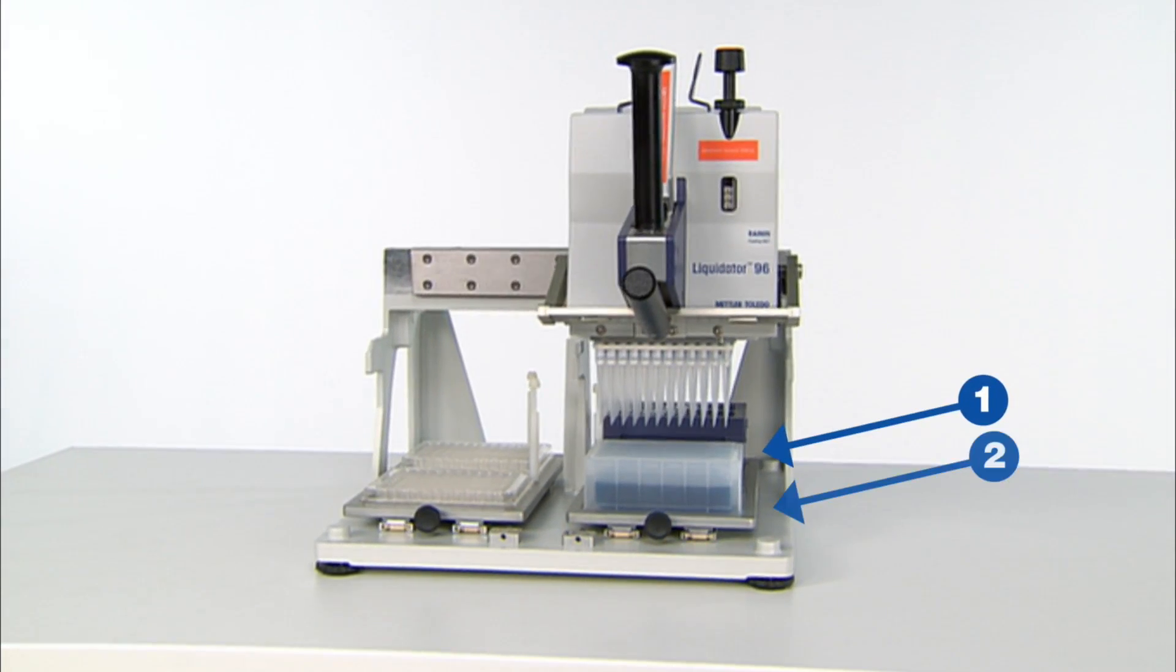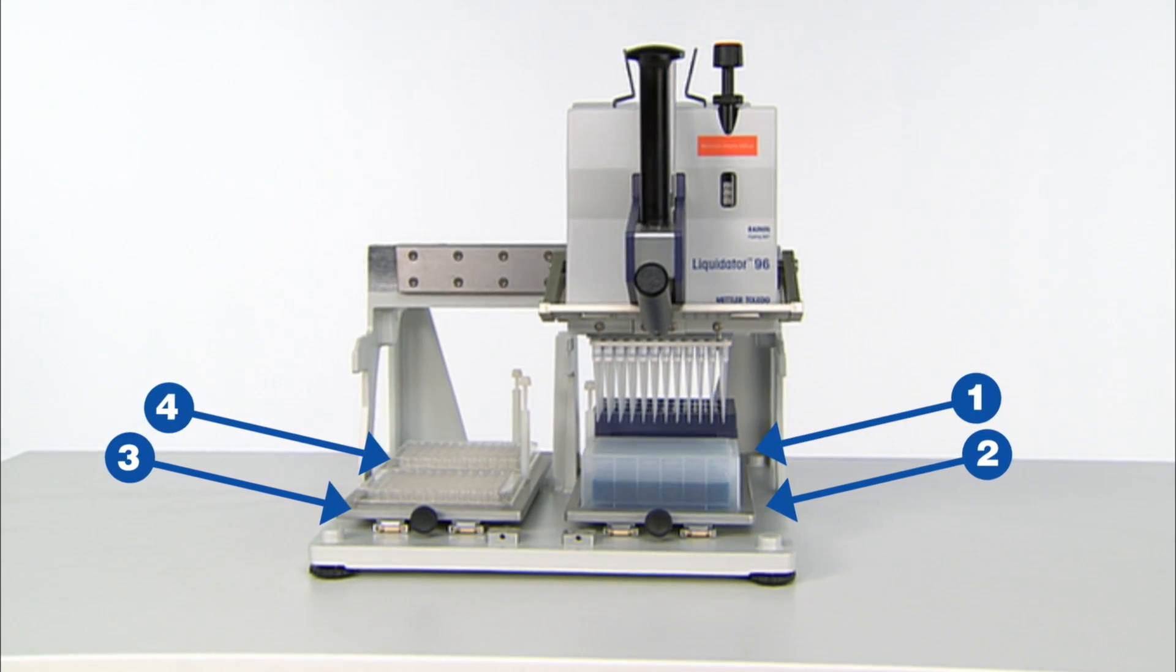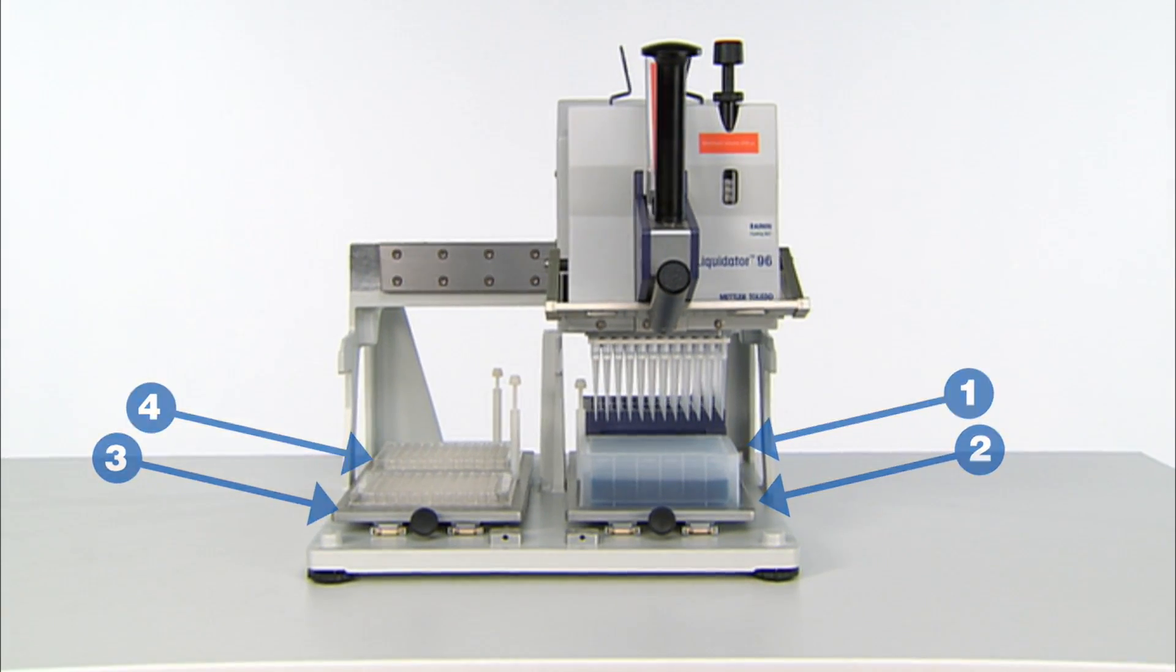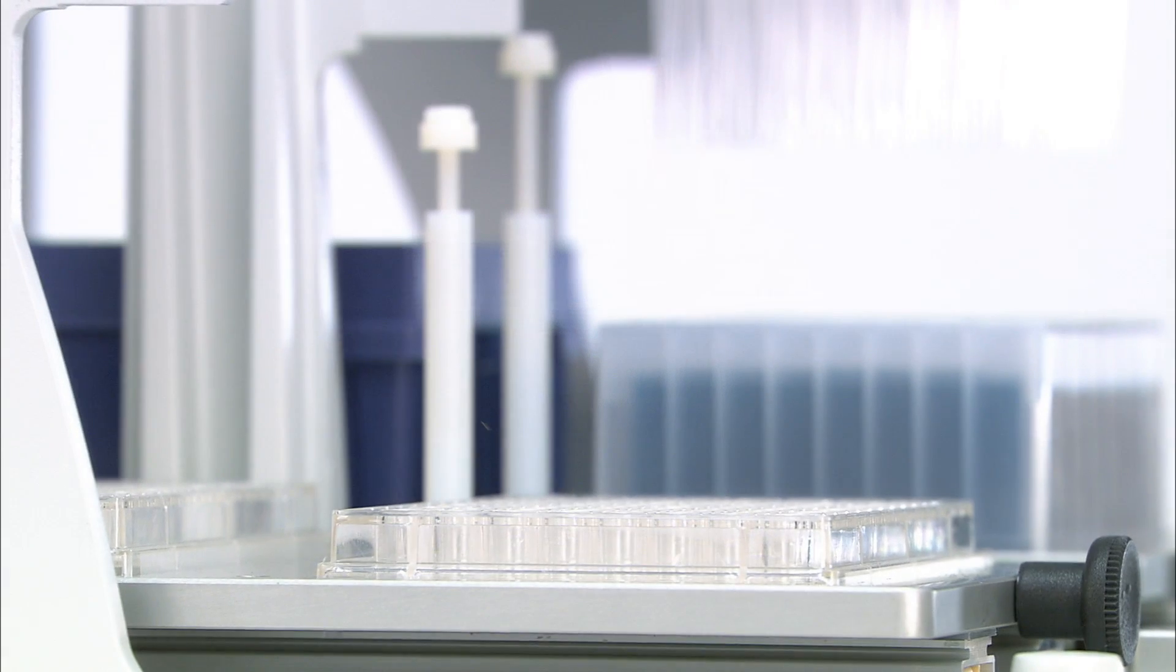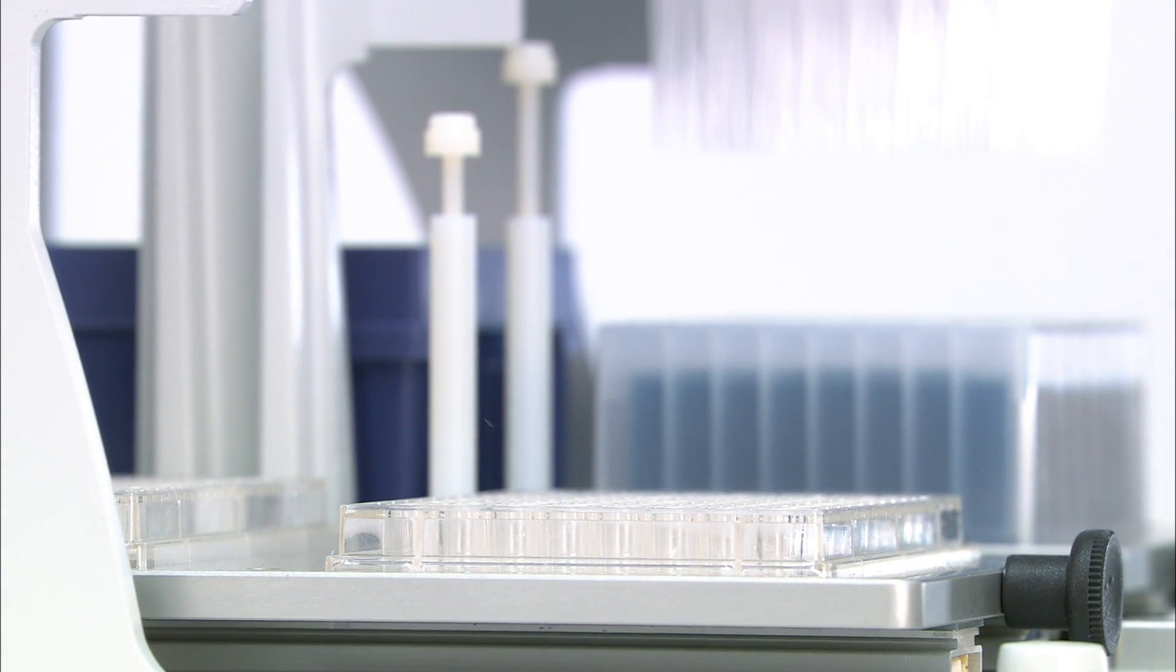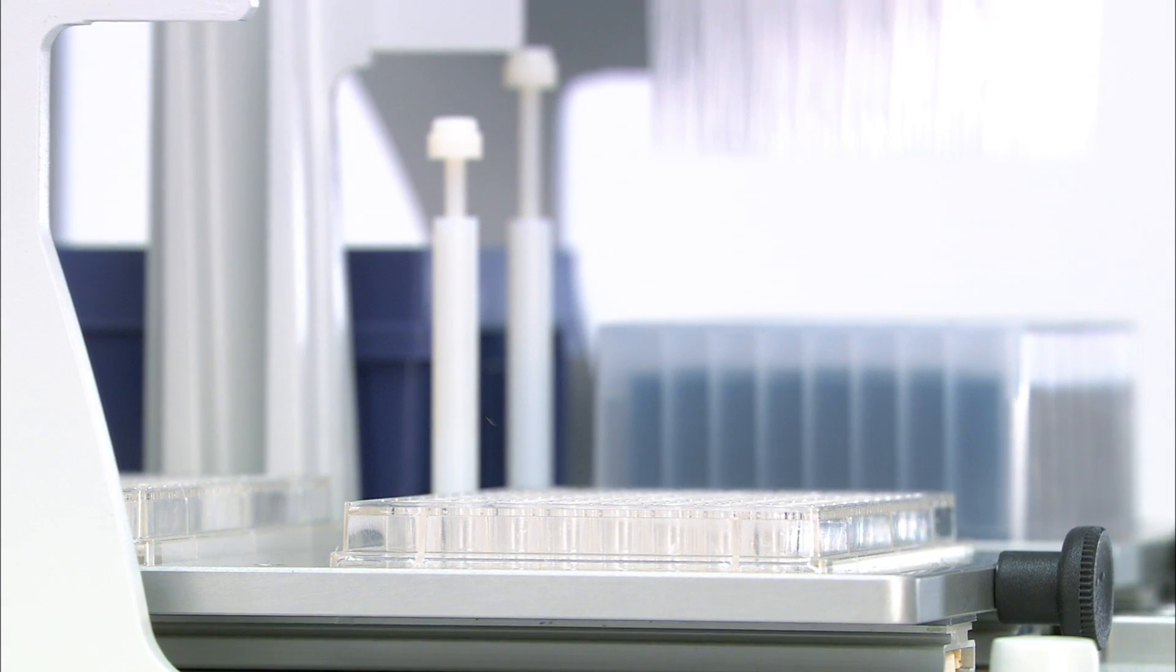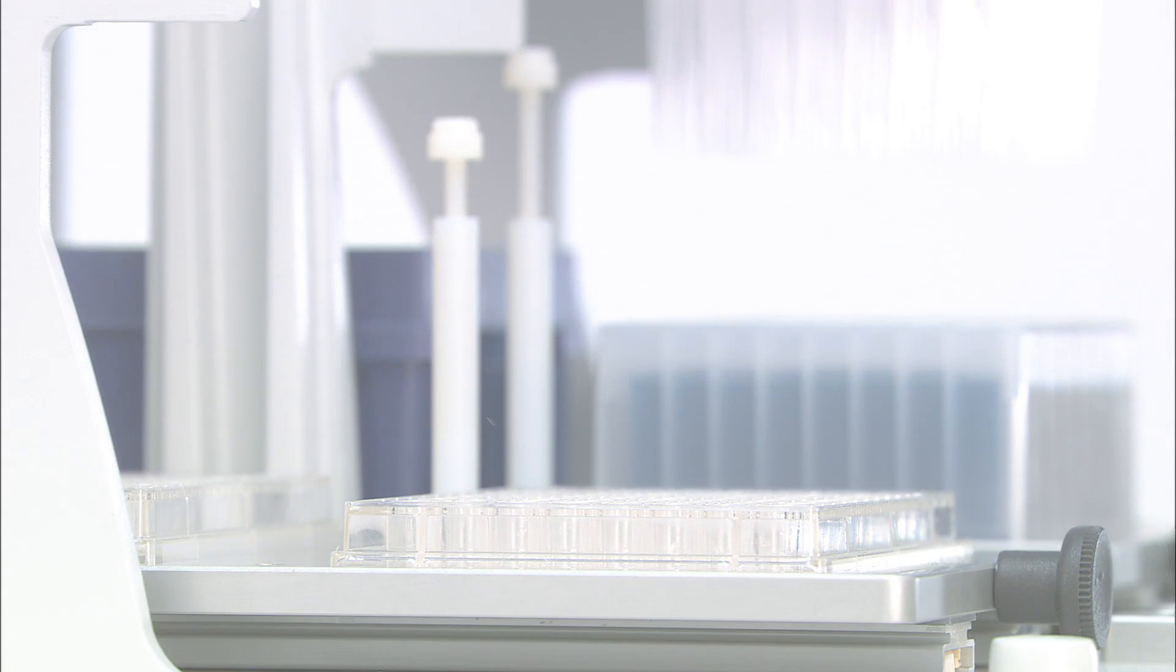The four working platforms on the Liquidator 96 are conveniently configured so that users can pipette with either the right or left hand, depending on their preference. Here we see a Liquidator 96 with two 96 well plates already loaded on the two left platforms.